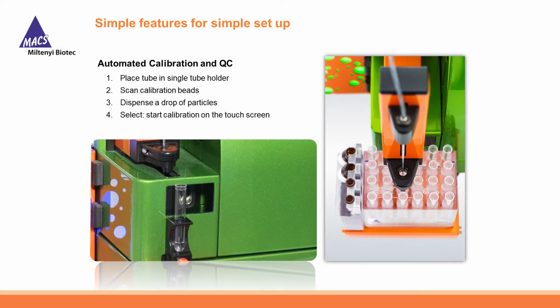So again, reiterating the steps, you're placing your tube in the single tube holder, scanning your calibration beads, dispensing the drop of particles, and then moving on to the touch screen to start the process, and that's it.